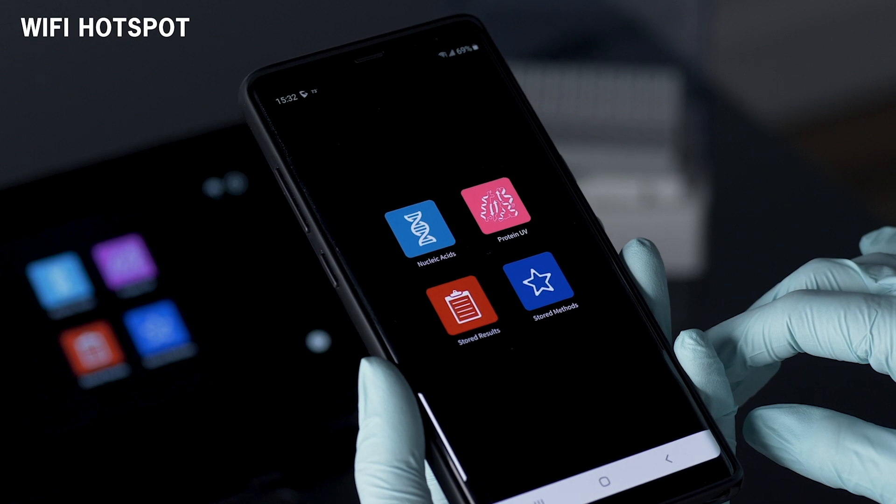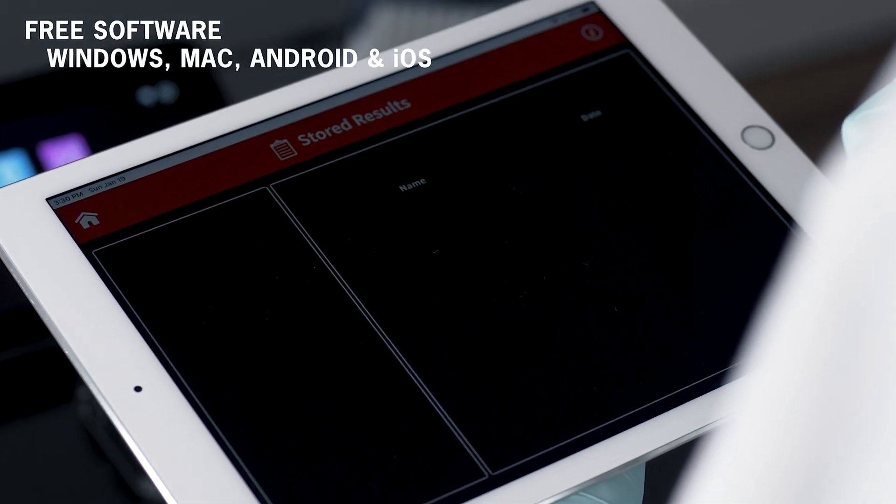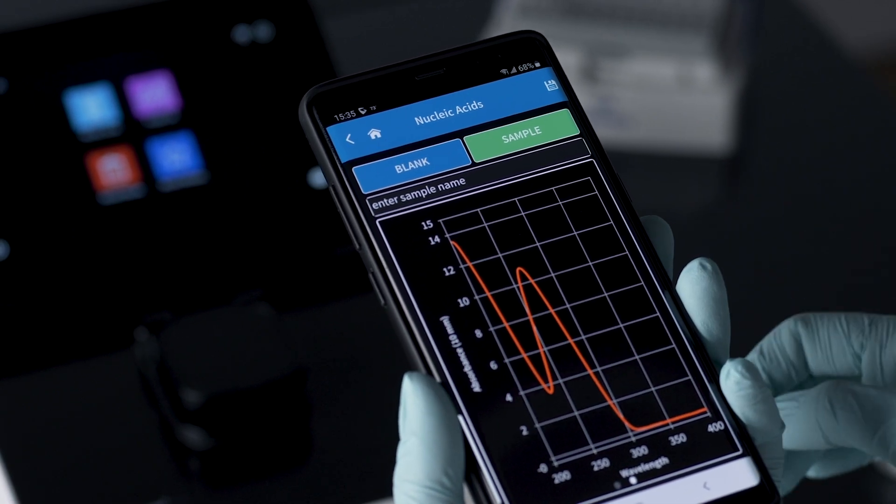A Wi-Fi hotspot is available for your convenience. Free software for Windows, Mac, Android, and iOS to control and access the instrument if desired.